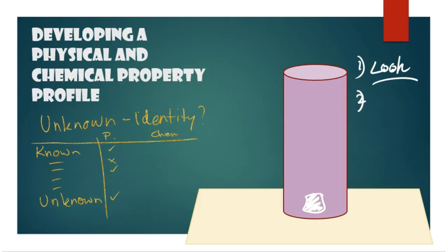So we always start with the simplest substance. We start with water. So you're going to be mixing it with water. And if it doesn't chemically react with the water, then you're going to be doing some tests on it to look at other physical and chemical characteristics of it. You could call them chemical, because one of the things you're going to be checking is its pH. That's whether or not it turns into an acid or a base when you mix it with water.